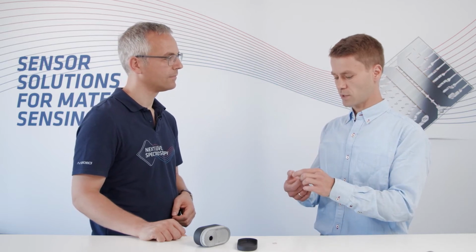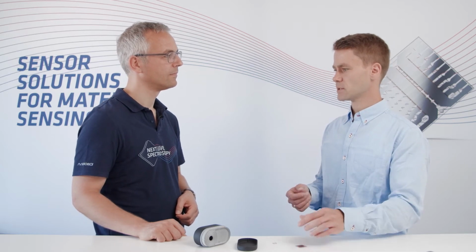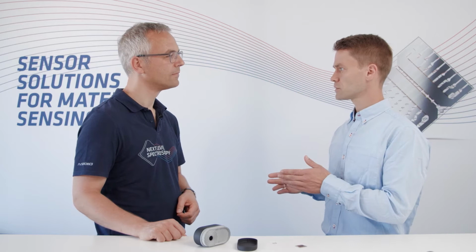Yeah. So usually in conventional technology, you have a broadband detector, and you need a conventional dispersive element, which is disentangling the white light into the individual spectral regions, and then the detector sees only monochromatic light. In our case, we don't have a broadband detector, but we have a narrowband detector. We can tune the spectral sensitivity over the complete spectral range, and we can really tailor our spectral response to the application we want to target.